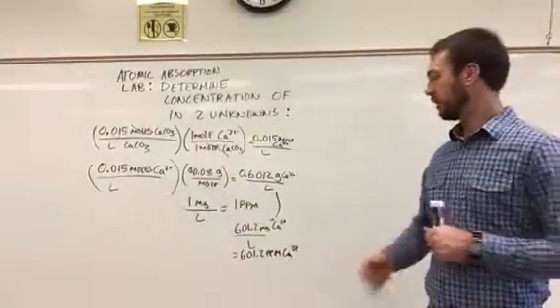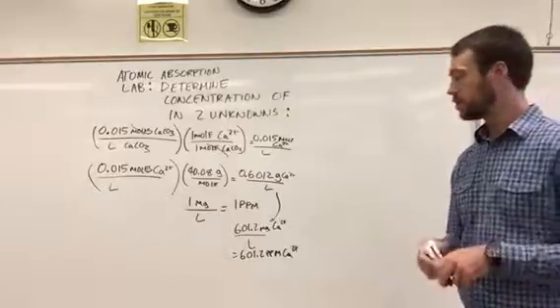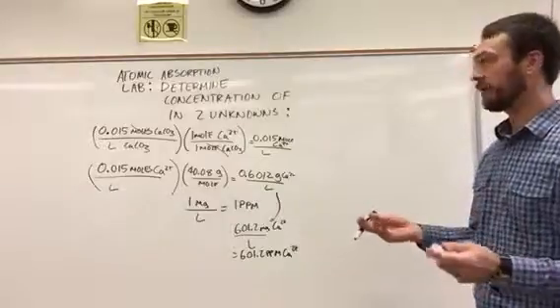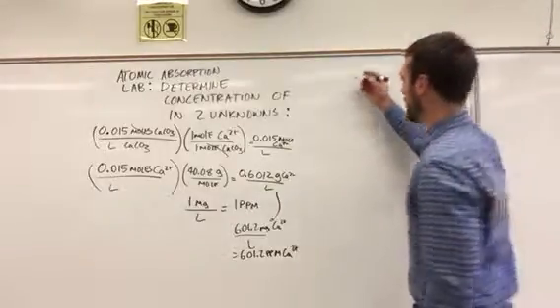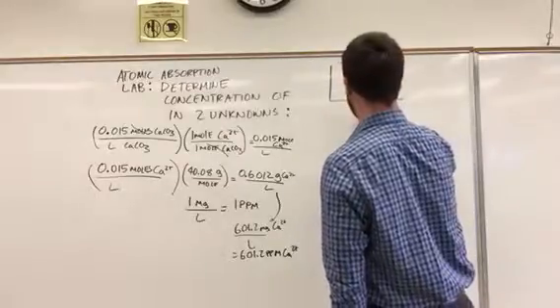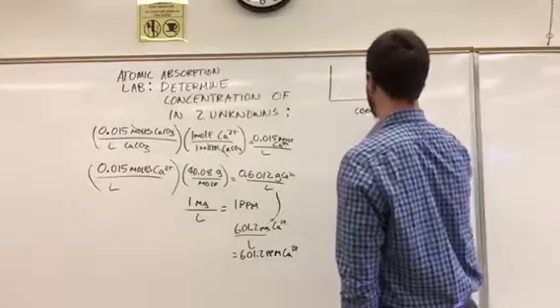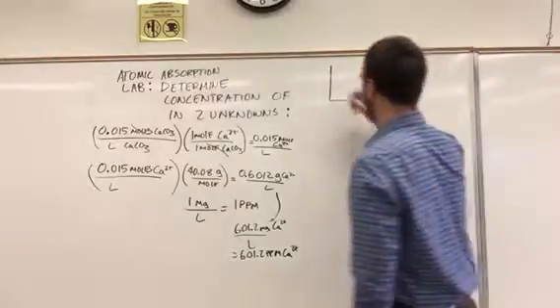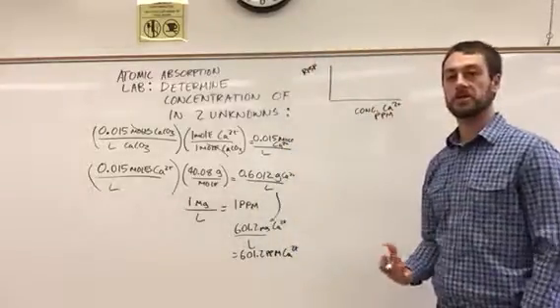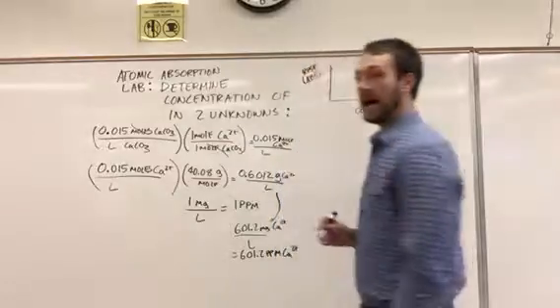Okay, so now we're going to use this solution of calcium to prepare our standard solutions for a calibration curve. So if we think about what we're trying to do, we're trying to make a calibration curve, where we've got concentration of calcium in ppm on the x-axis, and we've got response, and in this case, for the atomic absorption instrument, that's response in terms of absorbance on the y-axis.